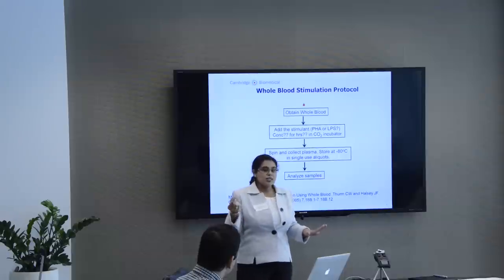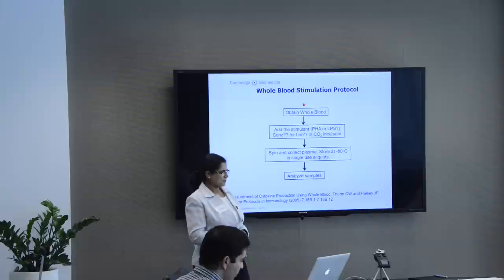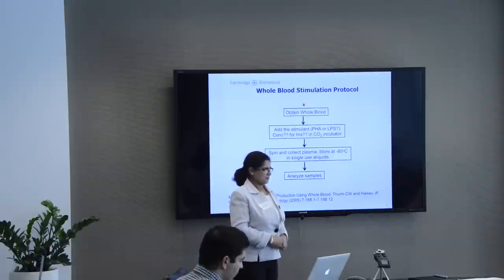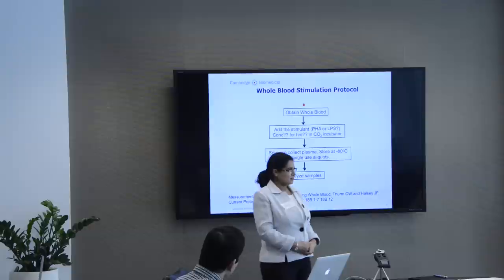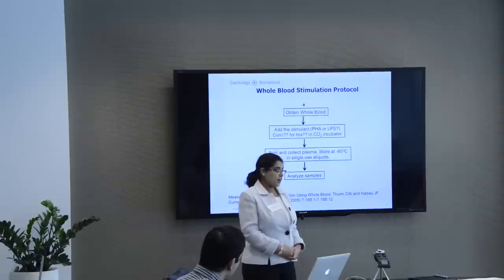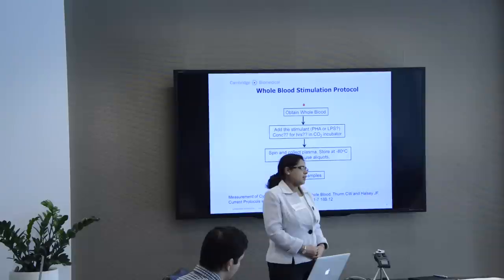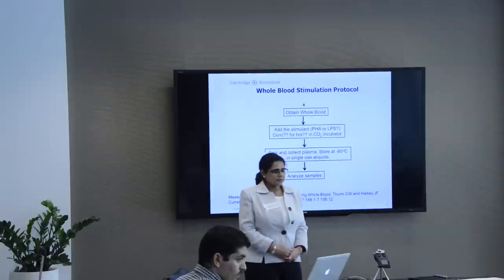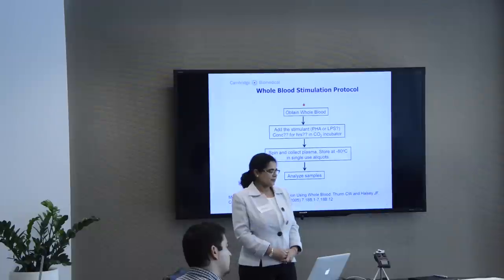You have to check your freeze-thaw stability during that stability testing validation. It'll fail. The other person abroad was having one, he had 100 enzymes, and he was doing a lot of freeze-thaw and he produced results. So what is so different? That's enzyme activity. It's not cytokines. I cannot vouch for the enzyme activity, but years ago I was working with enzymes, and I know that they lose activity depending on how you store them. So storage is very important. Another thing is that we were storing it in buffer. We have to spike it in plasma or serum, the sample which is coming from the patient. So matrix activity.